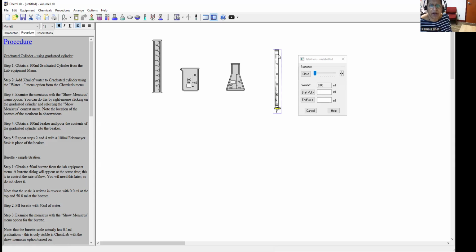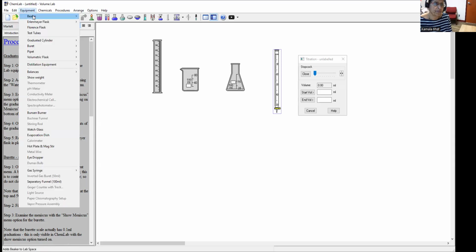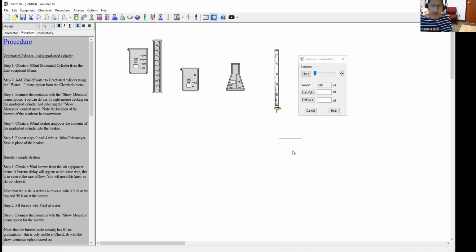As it drains out, you will see that the color changes. Right now, it's very white. It will change, and therefore you know that the burette is draining out the solution.